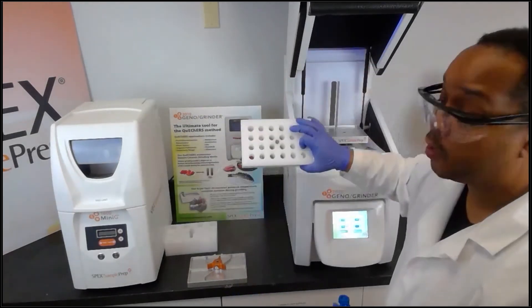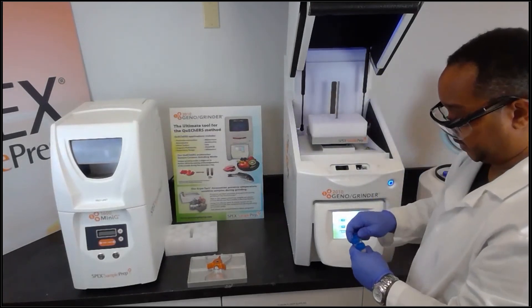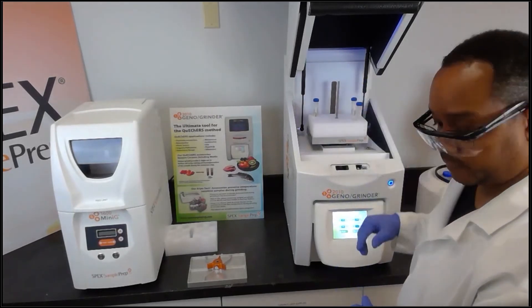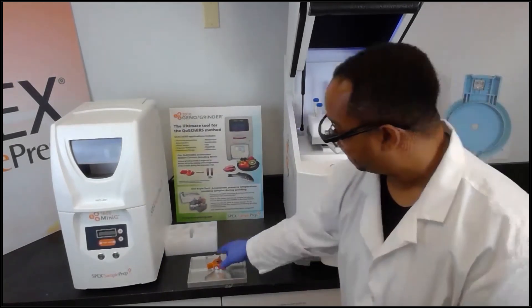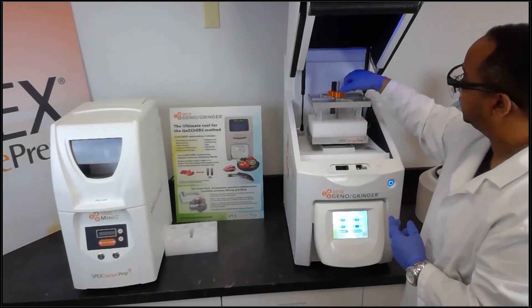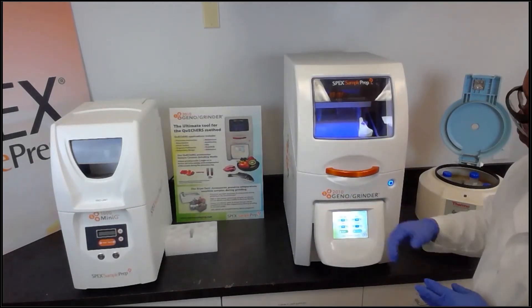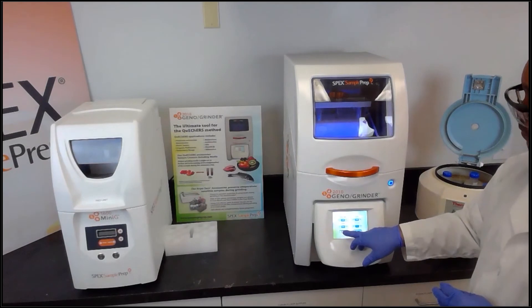We want to place these back into the GenoGrinder for a simple agitation step. Here we have a foam holder for 15 milliliter tubes — we simply slide this onto the threaded rod and place it in the clamp as before. Since we have a limited number of samples, we place them in the corners and use a blank as a placeholder. We apply the lid, slide it down, give a few turns to secure, close the lid, and set the runtime again for one minute at 1500 strokes per minute, then press run.